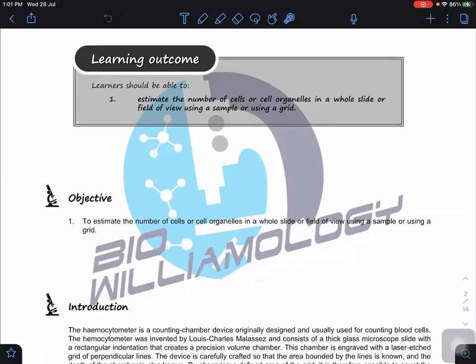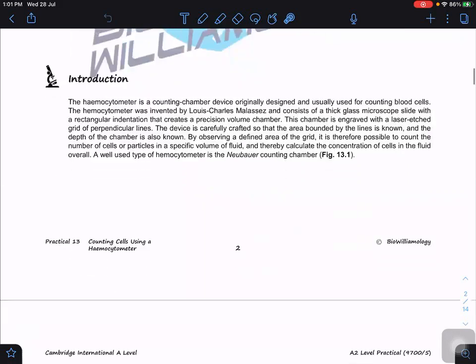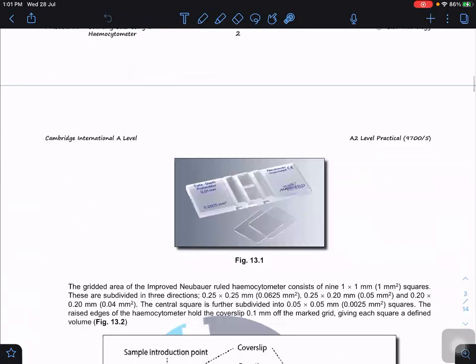Okay. So what's the hemocytometer? If you look at the structure of a hemocytometer, it will be something like this. This is a picture of a hemocytometer. You will have the sample loading well here, these two chambers. Can you see that? These two chambers, and they have a groove. Can you see the groove? I will tell you more about the function of the groove and the function of these chambers.